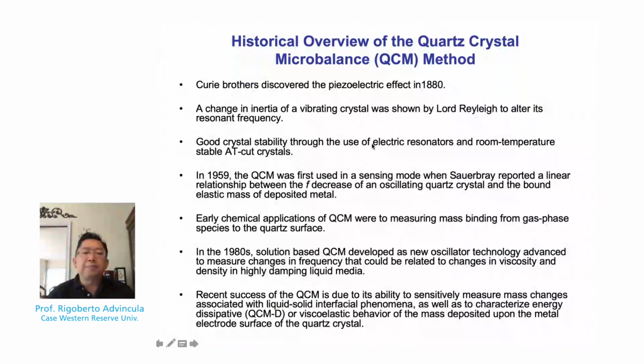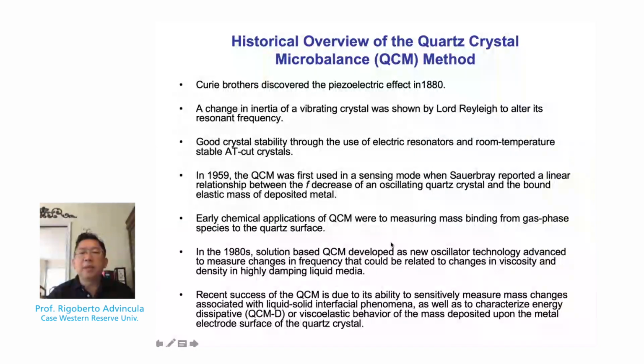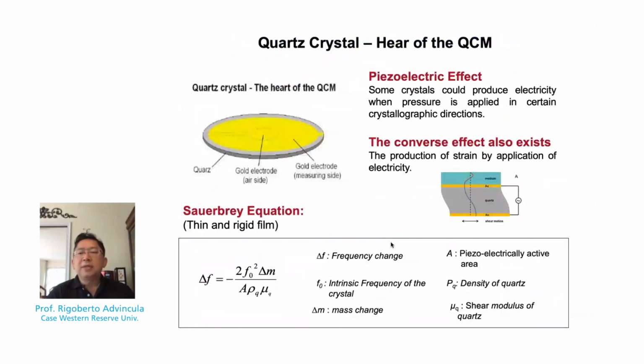In more recent applications, a lot of people refer to QCM based on the utilization of the dissipation mode, what we call QCM dissipation or QCMD, which is quite sensitive to the viscoelastic behavior of the mass deposited on the quartz crystal surface. So having given the historical background, we can then look at the basis for the quartz crystal microbalance.